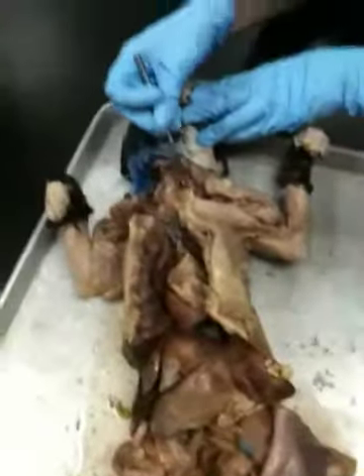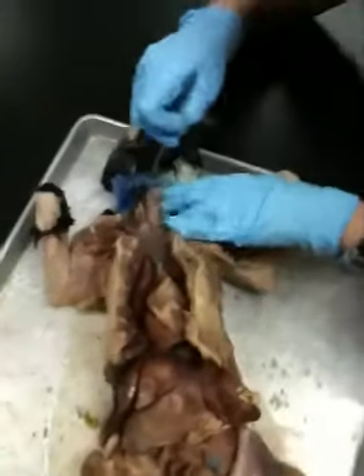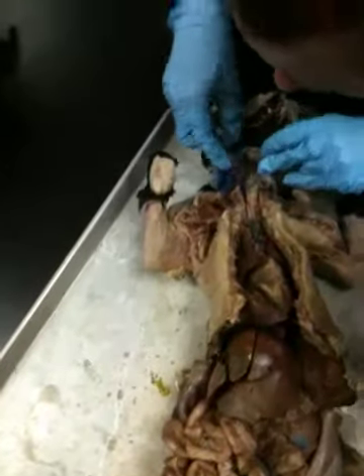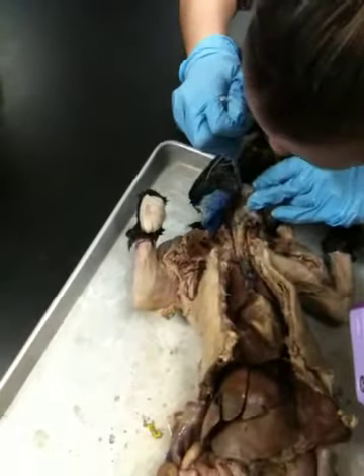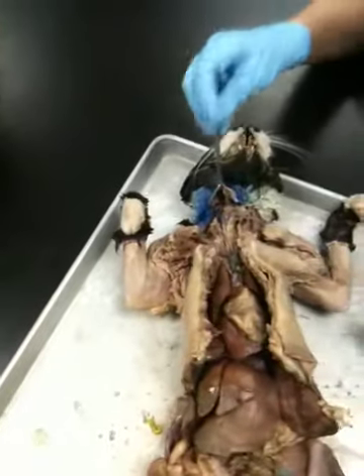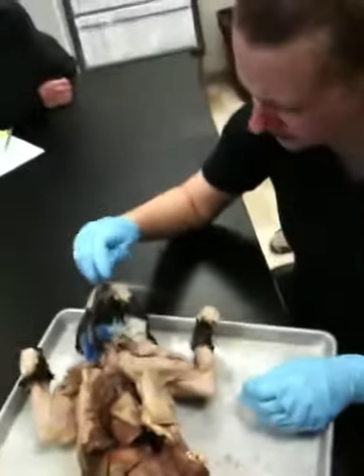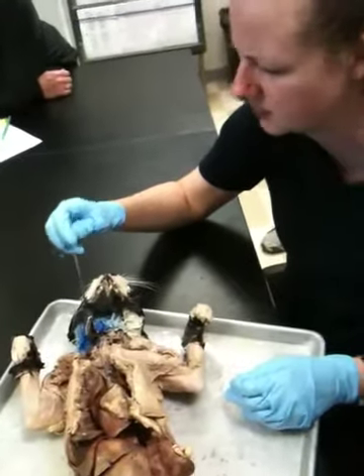And then what's coming up? Is that the common carotid? Common carotid, and then it will split. Looks like you can go up here a bit, but not far enough. That one would split into internal and external carotid. And there is one group, I think, that took the skin off for the face, anterior and posterior facial.